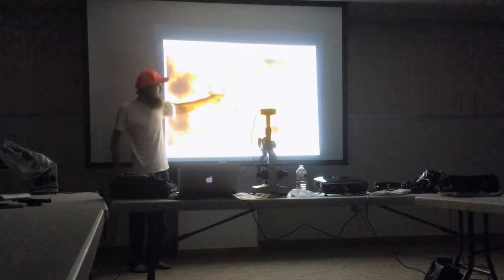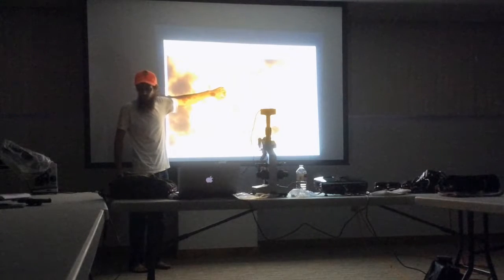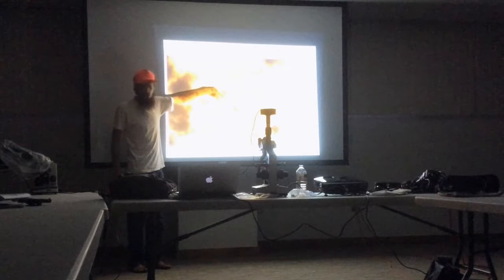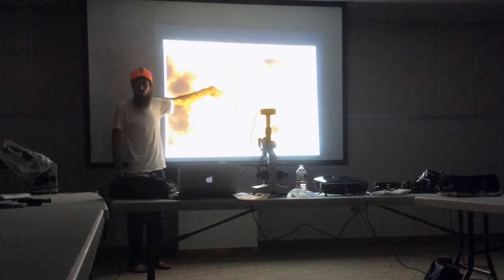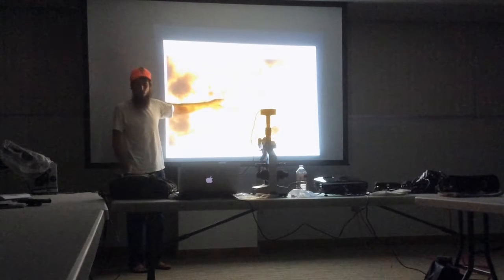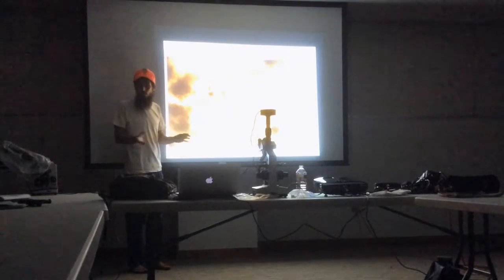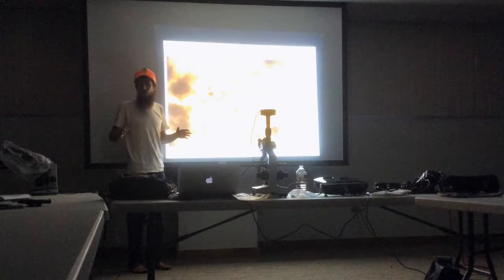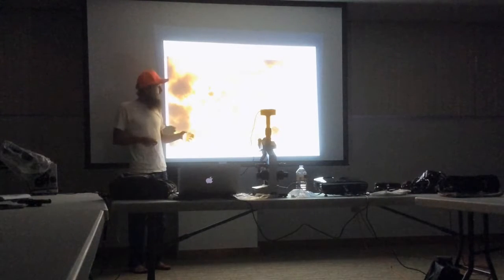But because this guy is much thinner, only about 2 micrometers across, I would say that this chunk is most likely not actually a beneficial fungus. Even though he is of the dark color, the size makes more of a difference, and the color is the secondary part of that.